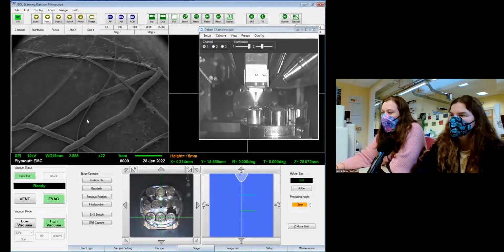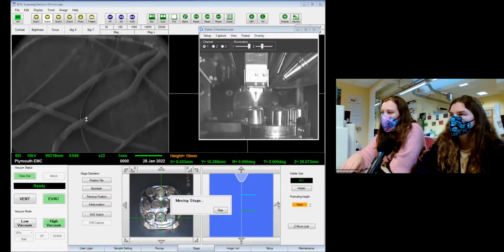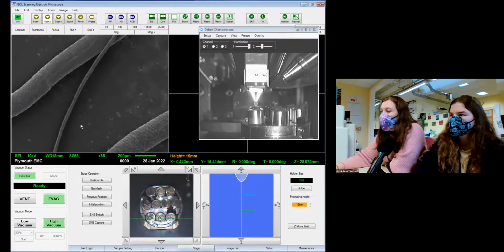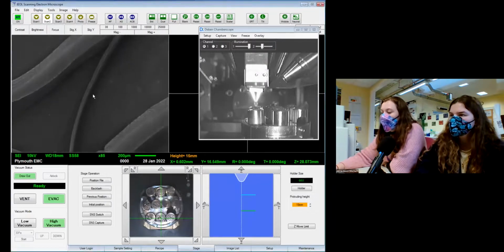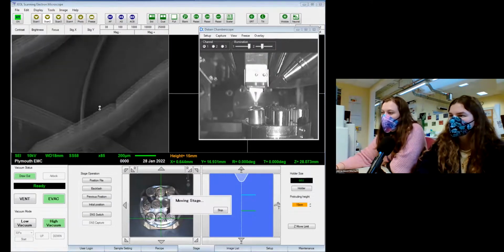We've got quite a lot of samples from Dartmoor Zoo now. They've been very kind to us. That's where we got our reindeer hair from for the winter SEM edition. So today I had a rummage through our little box and found some wolf and some tiger hair.